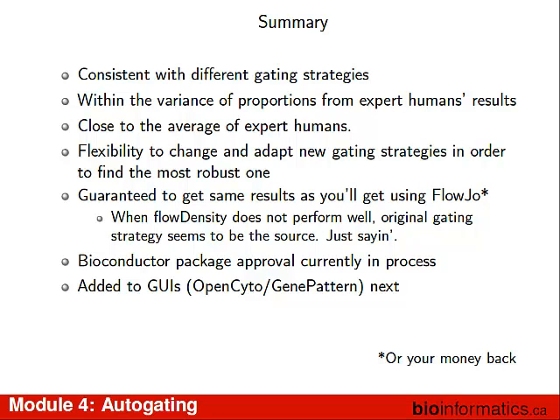So in summary, I'm really excited about this tool because it seems to work. We've used this one on 3 or 4 different data sets, and it's been really phenomenal how well it's worked. And it's really great for me to be able to get up here and say, stuff is finally working after all these years. We spent writing, what you learned all about yesterday, all these tools to get stuff, doing all the quality checking and stuff. This is where it's getting more exciting, because we're getting what people want, which is to not have to do the manual gating. It's going to be within the average of expert humans, which is as good as they can get in terms of doing diagnosis. We can't do any better than that. I'm pretty much guaranteeing you're going to get the same results you're going to get by hand. If you don't, I will give you your money back.